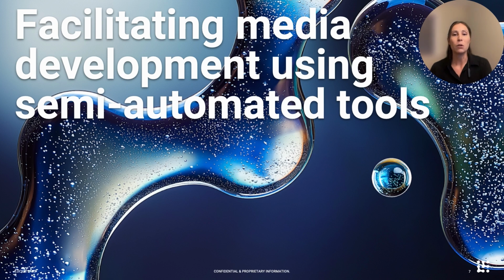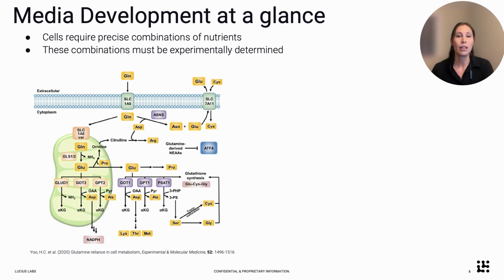So the first part of this will focus on facilitating media development using semi-automated tools, and an important part of that is going to be the FAST CDV. Before I get into that, I'd like to start with media development and exactly what that is. So just a little bit more background information for anyone who's not familiar with media development.